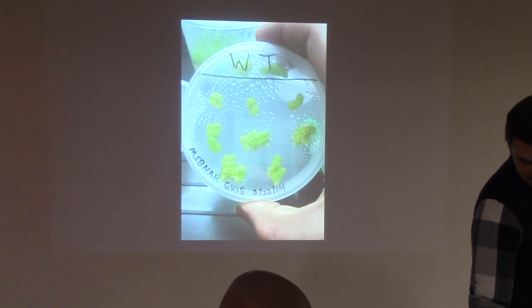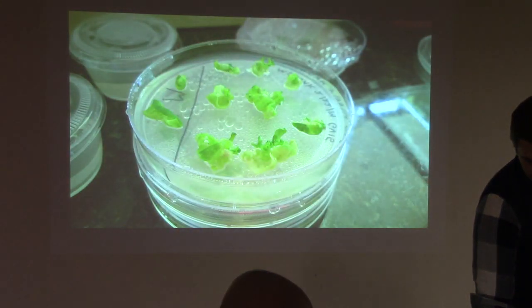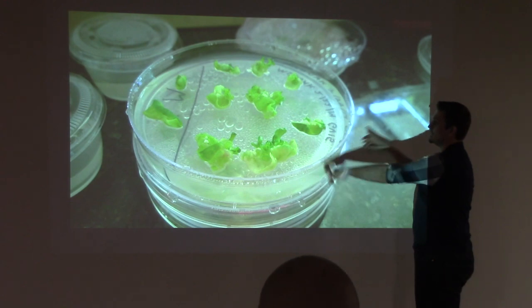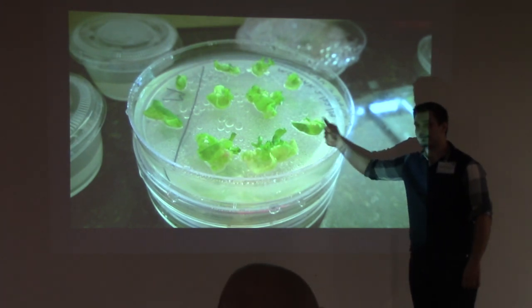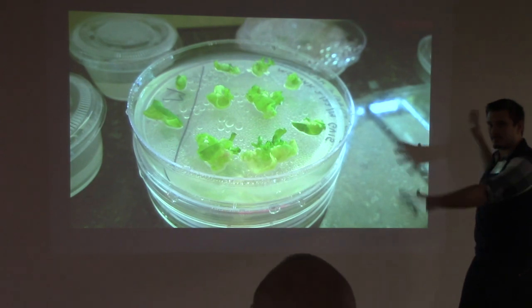So after another 2 weeks, the tissue starts to differentiate even further to make these like pseudo leaves. You can see them a little clearer here. So now my job as the technician is to take these 5,000, like, I wish I had a zoom out picture of this because I have like petri dishes everywhere. So every 2 weeks I have to transfer them. And these things actually double every 2 weeks. So 2, 4, 8, 16, shooting, it's ridiculous.